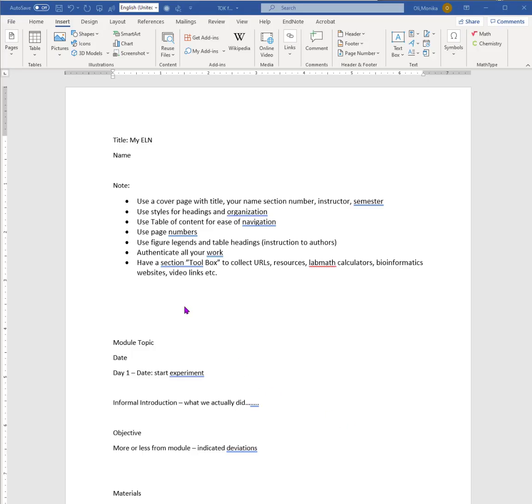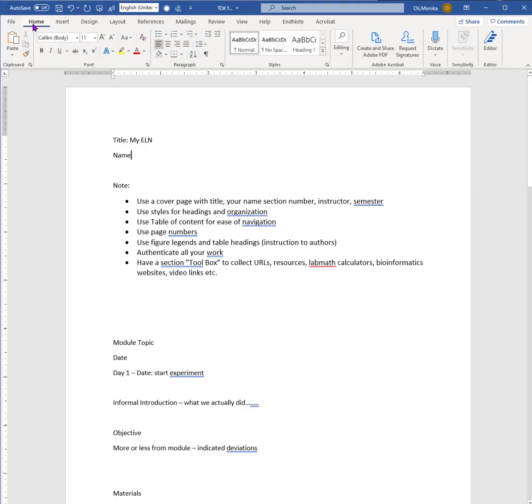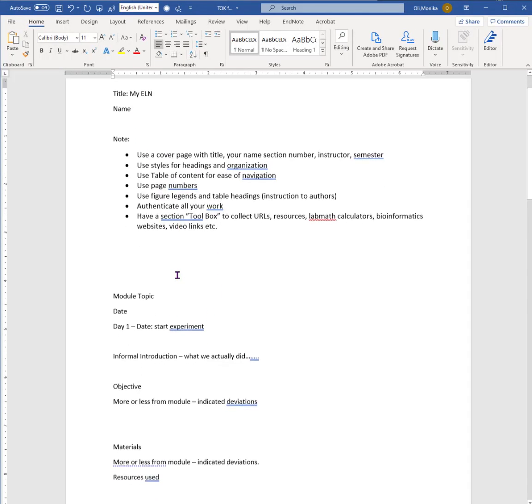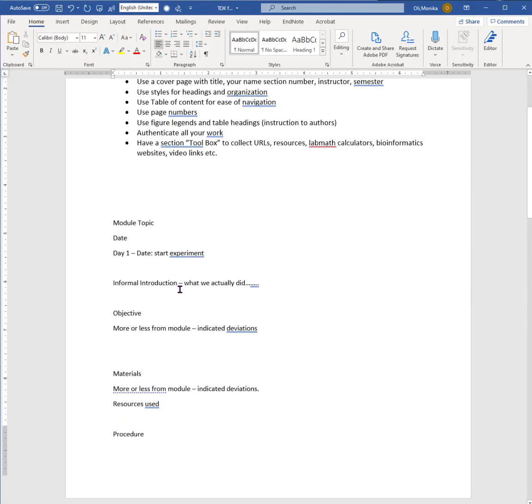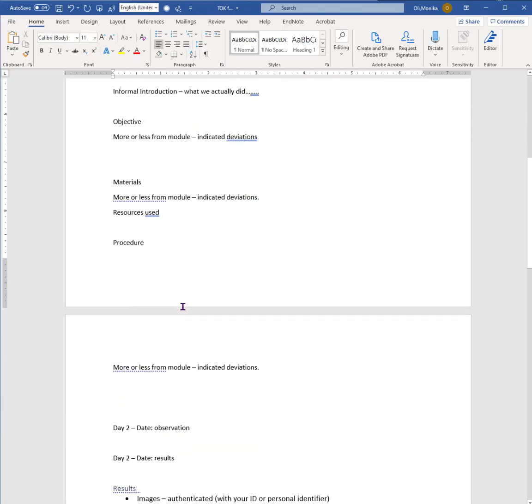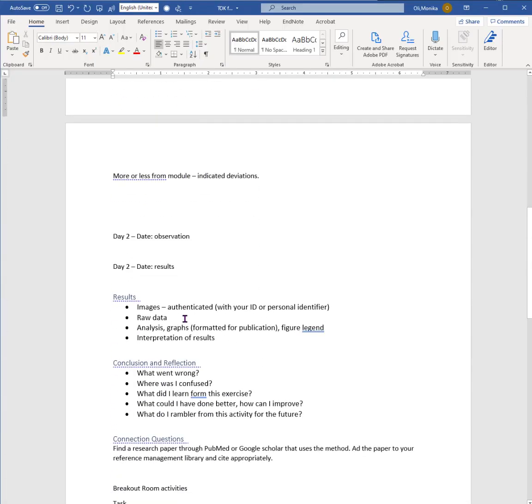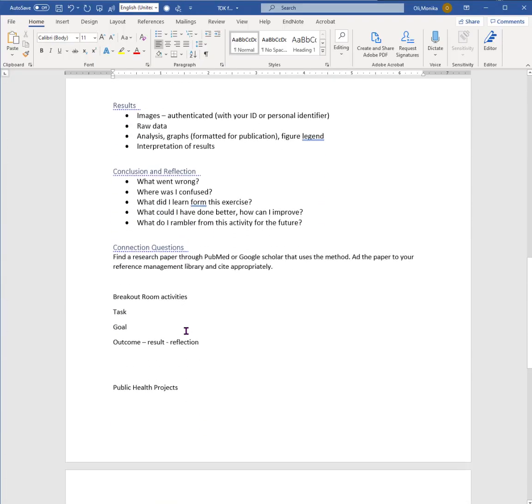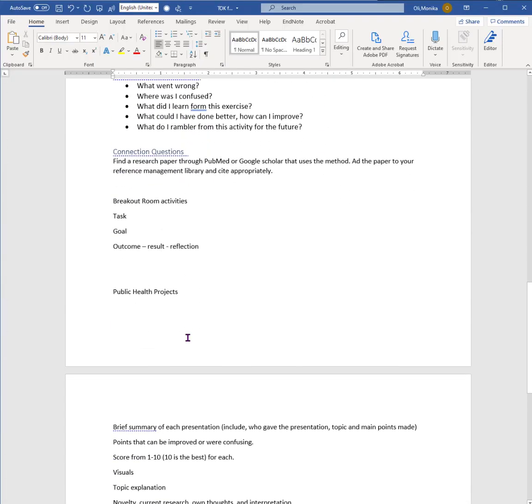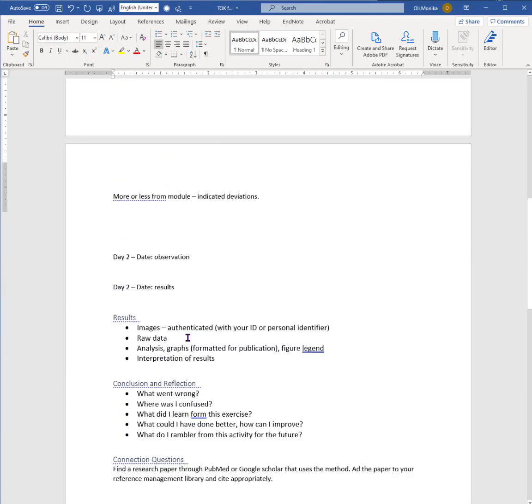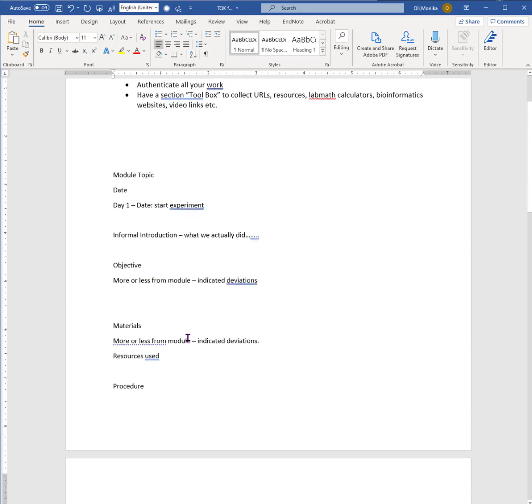There's a couple of points I want to make, and I also want to show you how to use headings and how to use table of contents in a Word document. Here's just an outline - you can see title, name, module topic and so on, it's just like a Word document without really much formatting.